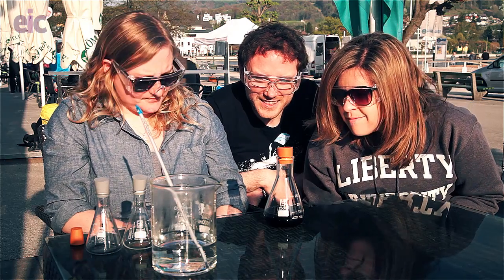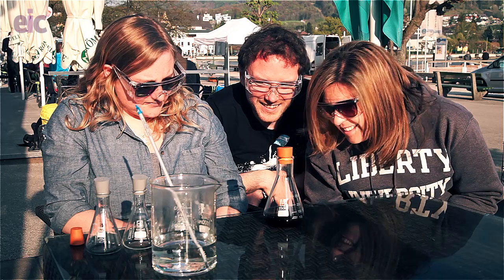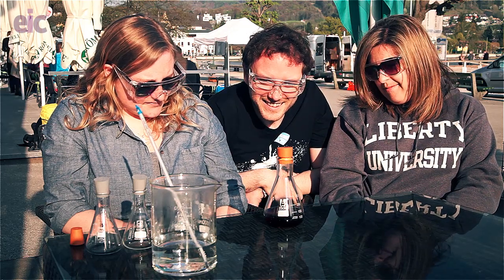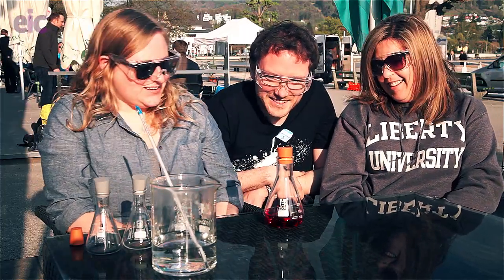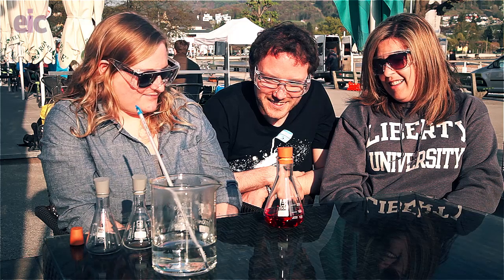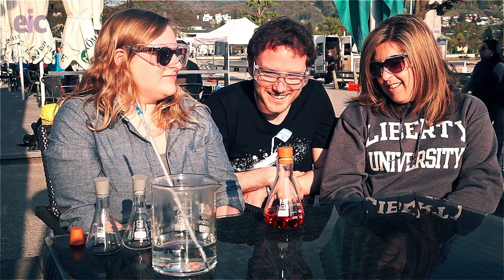We're going to give that a couple of seconds. Brown? Red? Is it red? Oh my goodness! Okay, it's red. Now we're going to orange. Wow, okay - orange, yep. And now finally... yellow.